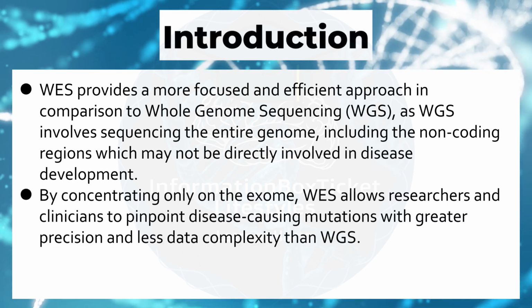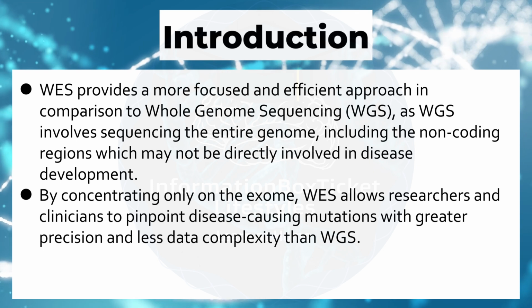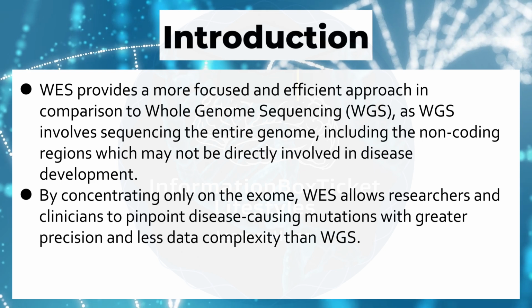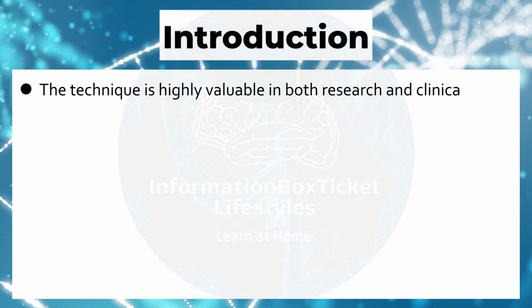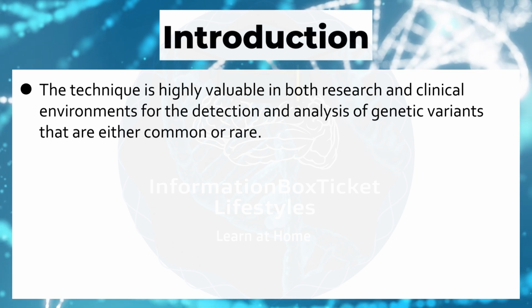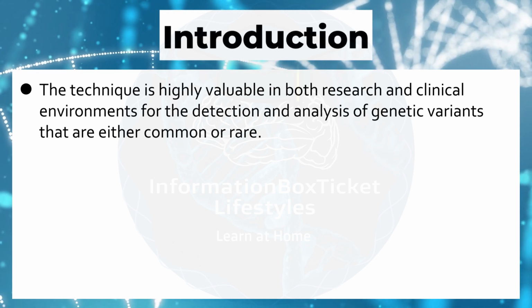By concentrating only on the exome, WES allows researchers and clinicians to pinpoint disease-causing mutations with greater precision and less data complexity than WGS. The technique is highly valuable in both research and clinical environments for the detection and analysis of genetic variants that are either common or rare.